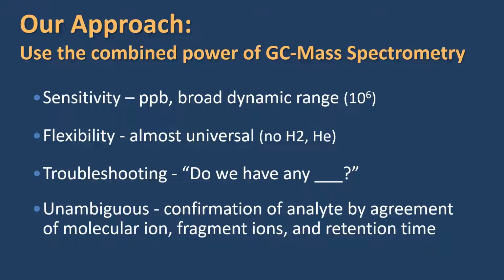If we have something that matches up, then we're going to have to say, wow, I need to go out and build up a calibration blend for acetaldehyde and quantify it. But if in fact I run through that sample and I see the mass spec data does not indicate acetaldehyde, I can say to the customer, no, we've checked this with actually online GCMS, and we find we have none of that in our sample.